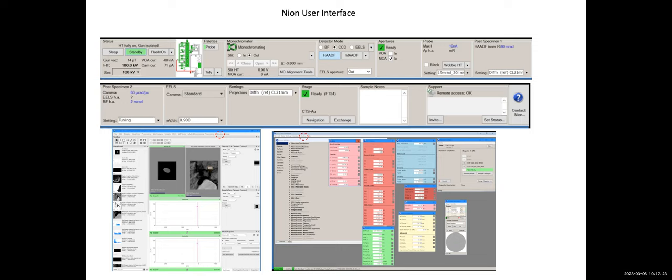If we think about the position of VOA, actually it's a C1 condenser aperture. If we look at the diagram and compare to other TM microscopes, we're actually in the C1 aperture position. And MOA is a special aperture in the monochromator, so that is something unique. It selects the optical beam in the monochromator to improve the energy resolution. So you can also take it in and out to see how it is selecting part of the beam.